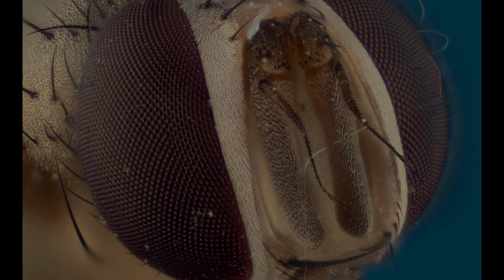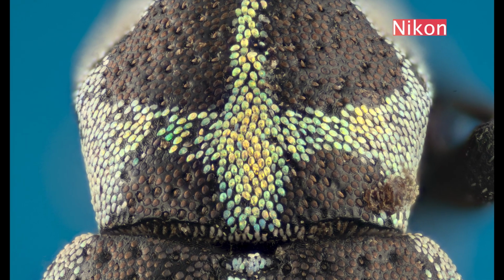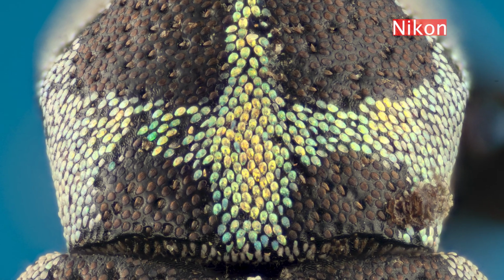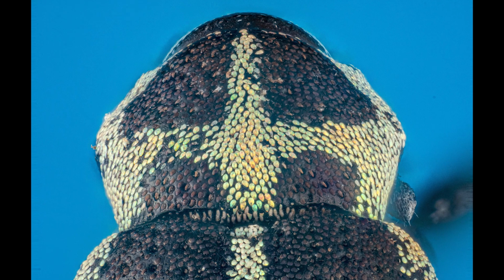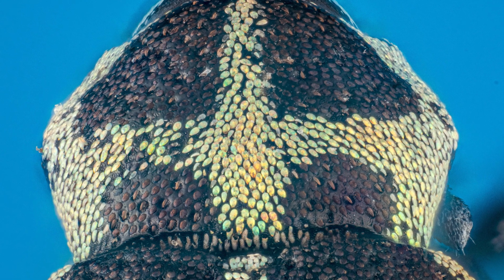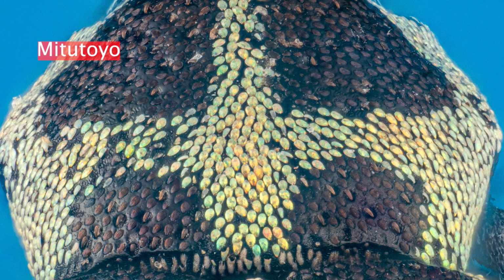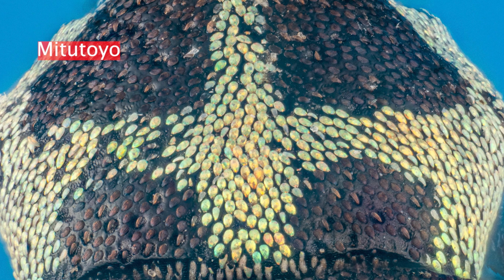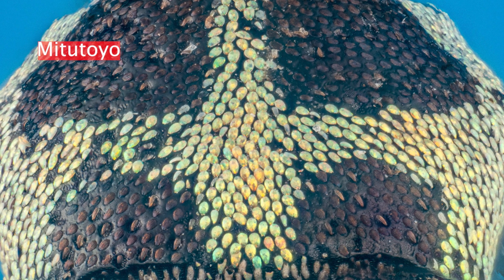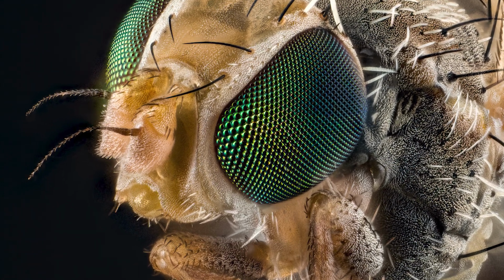Now, when I get together with the Patreon group, we're probably going to discuss these images in a little bit more detail and go through them then. But for right now, I don't see any point in belaboring the issue. But I do want to show you some photographs that I have taken since the comparison that show, I think, a lot more of what this objective is capable of. I'm talking now about the Mitutoyo 10x with the ITL 200 tube lens. All of these images that you're seeing now were shot with that combination of lenses.